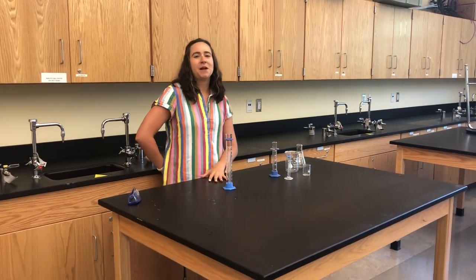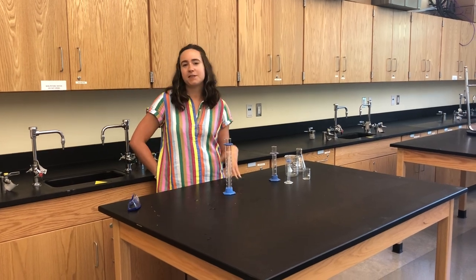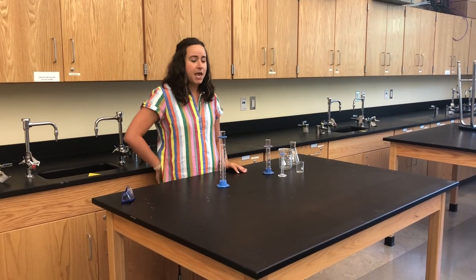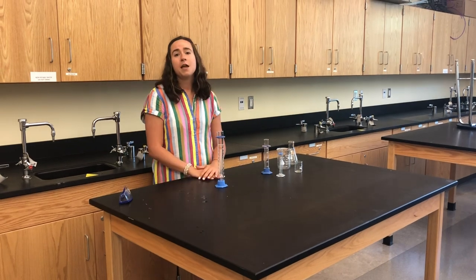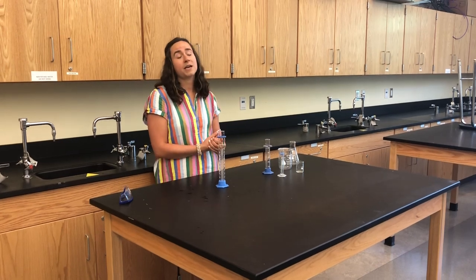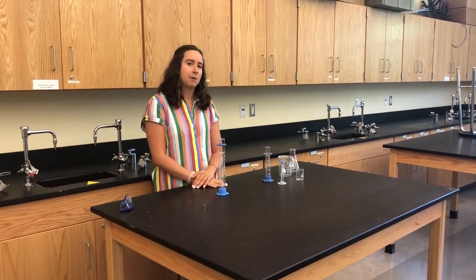Hi everyone! I'm Ms. Zabedio and I'm one of the chemistry teachers here at NHS. I just wanted to take this time to introduce you to some of the most common lab equipment that you'll be using on a sometimes daily basis. It's really important to know the difference between each type of glassware because they all have different uses and purposes, and when it comes to following a procedure you want to make sure you're using the proper glassware.